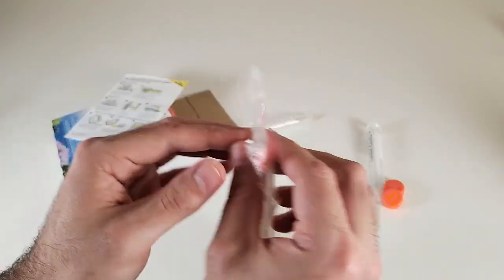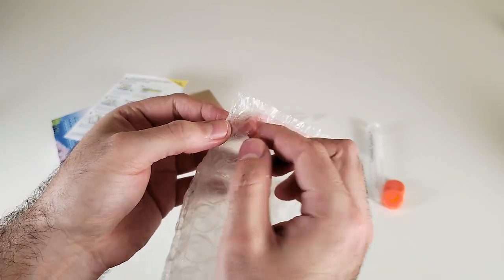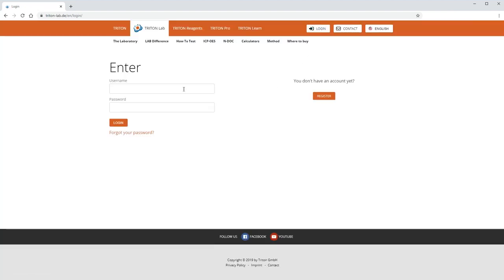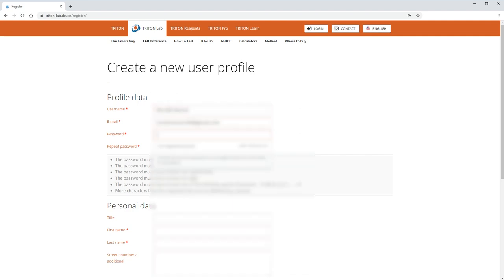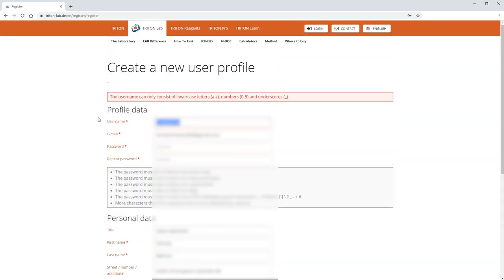And that's it. All right, so now let's go to the first thing that you need to do once you have the box. Before using the Triton ICP water test kit, you will need to register first. So go to their web page and create a new account if you don't have one. Make sure to fill all the important data and don't mess up like I did. I put my name as a username and make sure to have a good password. Damn it. Make sure you really have a good password.